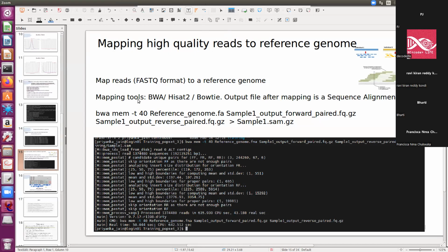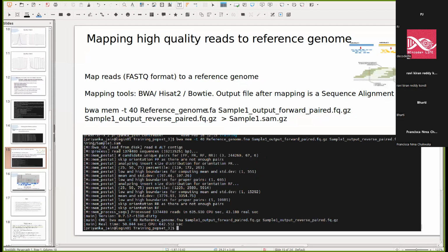The higher the quality of your genome, the better will be your result. Because sometimes some organisms have a draft genome, and those draft, unfinished genomes always have some errors in them. As the quality of the genome improves, we get a better result. Because if it is reference-based alignment, then all your final outputs are based on the quality of your reference.